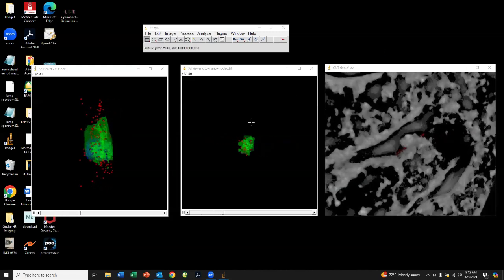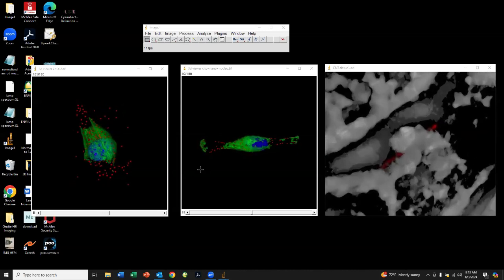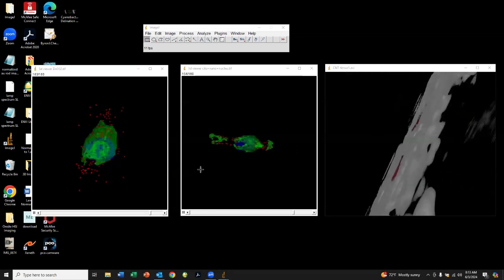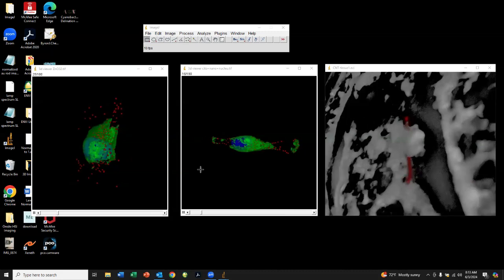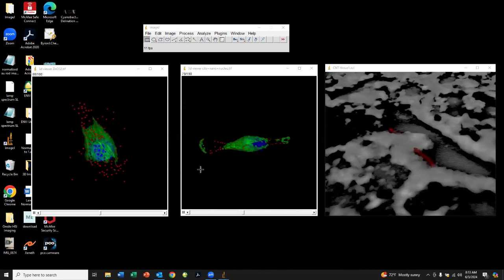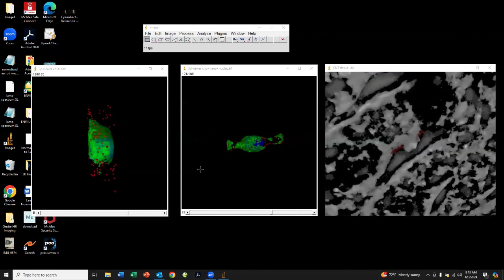And here we want to show two images on the left and the center of fluorescently labeled cells, where the cytoplasmic area is green, the nucleus of the cell is blue, and the red dots you see are nanoparticles that have been internalized by the cell structure, or in the case of the image on the left, are sometimes internalized by the cell structure, but also on the outside area of the cell structure.